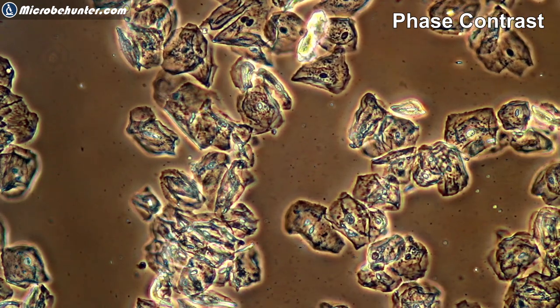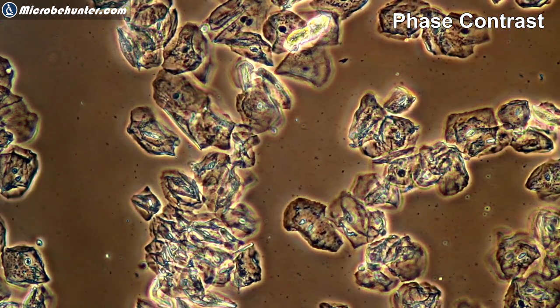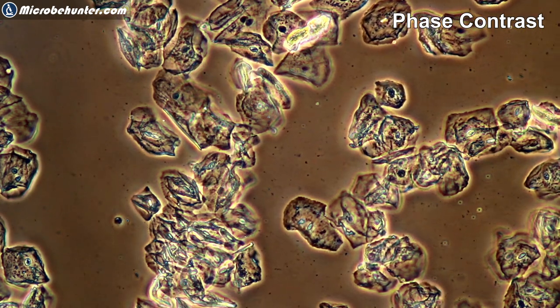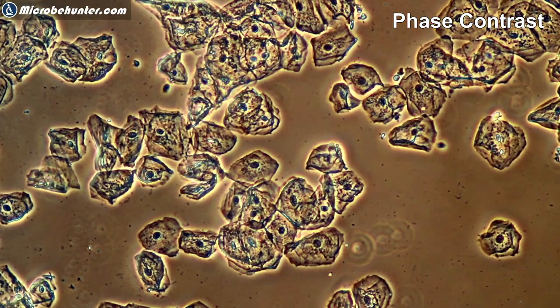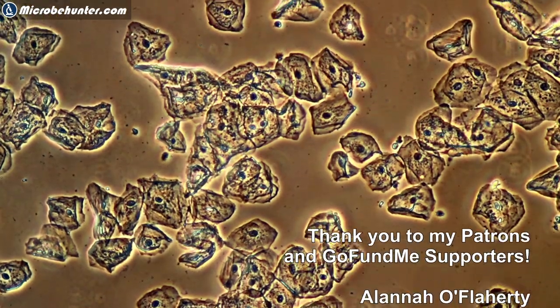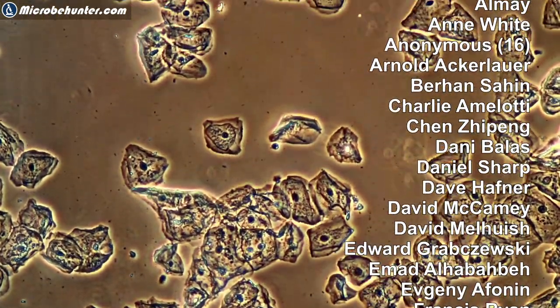As I mentioned before, the halo, the individual cells seem to have this bright halo around them. That is very typical for phase contrast. It's an artifact. Some people don't like that because that's not the way that the objects appear in nature. But it still increases the contrast and therefore makes certain structures more easily visible.